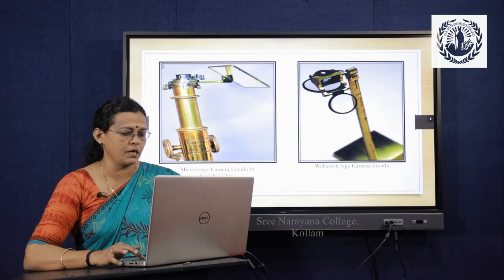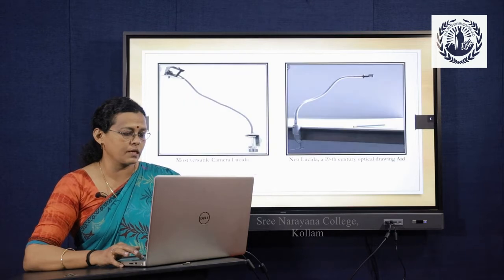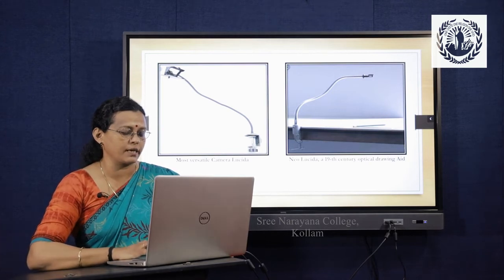These are some of the camera lucida that were used in the olden days. They are highly versatile, that means you can see that this particular handle of the camera lucida is flexible and its position can be changed easily.